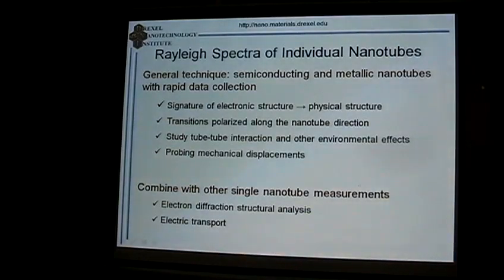Are there some tools of structure refinement for Raman spectra, equal to Rietveld refinement? Not really. There is nothing that would be equal to Rietveld refinement in XRD.